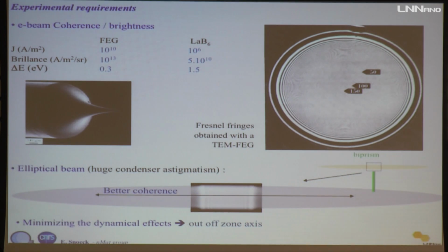It means, like this lamp, these lamps are very intense. This laser is not intense at all, you see, but it's very bright. Okay, it's very bright because it's very coherent. Very tiny dispersion, energy dispersion. But you cannot light a whole room with that. You need to have this lamp. If you want to do interference, you need to have a laser. You cannot do interference with this kind of lamp.